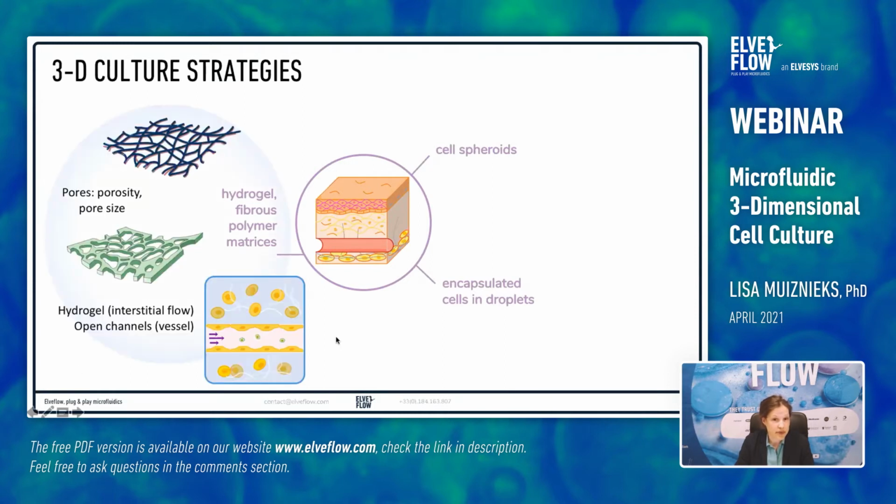3D cultures commonly take the form of cells embedded in a polymer-based scaffold, which is a design derived from the native extracellular matrix of tissues. Commonly, polymer chains are cross-linked in the presence of water into a 3D hydrogel. Now, a wide range of polymers can be used, both natural or synthetic. Some common polymers include polyethylene glycol and PEG copolymers, as well as alginate and collagen. Pore size and mechanical stiffness can be tuned via crosslink density.